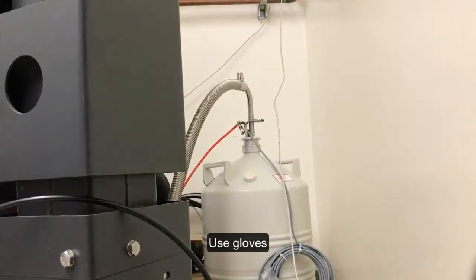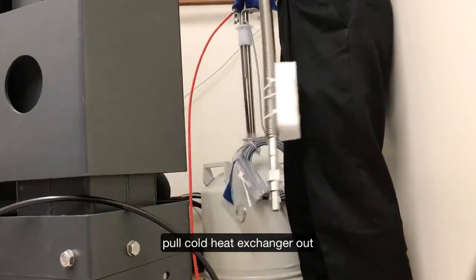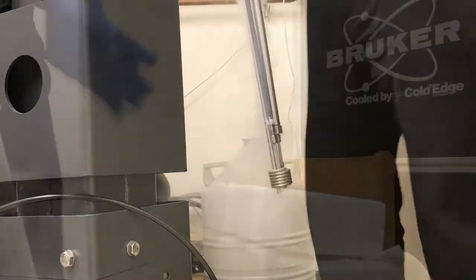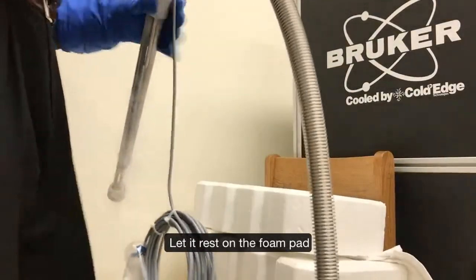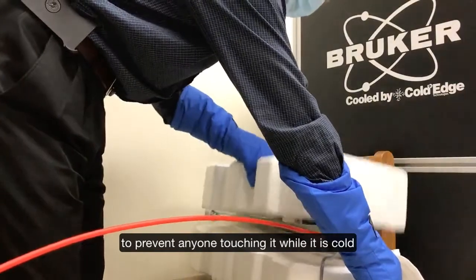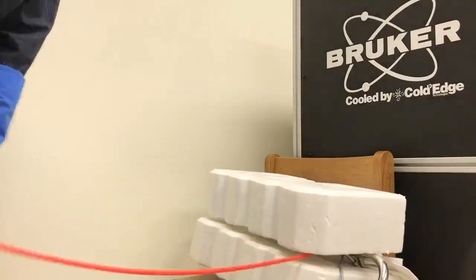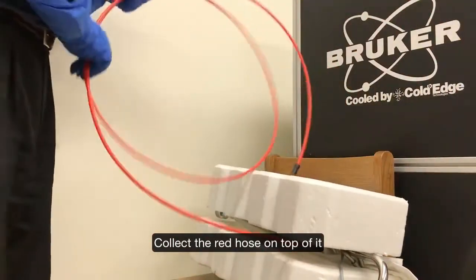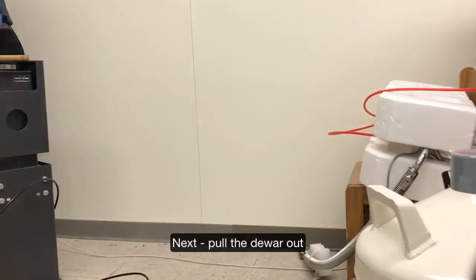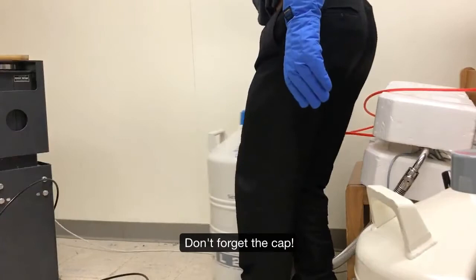Our next step is to remove the cold heat exchanger from the probe. It is very cold and we want to use gloves for this. On the foam pad, we are going to place it over here and cover it to prevent frost buildup. All the red pipe goes on top. Put it in the cup and gently pull it out.